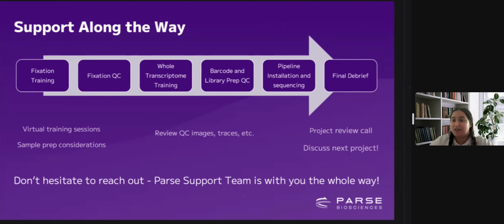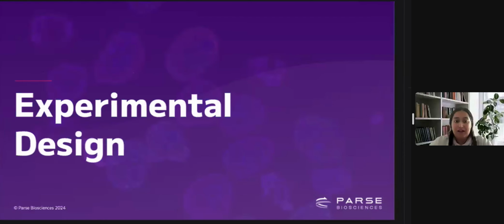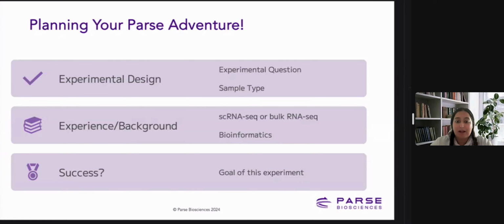So any questions so far? Nope. Awesome. So before we get started, just wanted to talk a little bit about your experimental design. Let me actually pull up my notes if you don't mind. I'm gonna stop share. So Brian, I wanted to ask, do you have any current experience with the sample type that you hope to run on Parse? Have you run it on any other single cell platform?